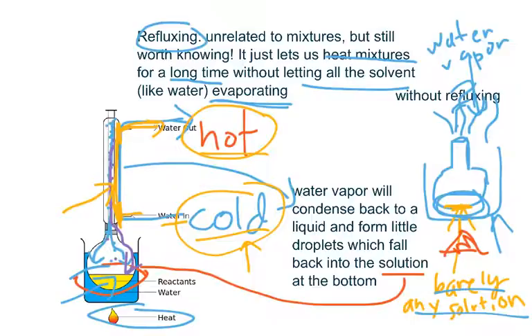And when you cool something down, you're basically absorbing the heat for it. So this gas will turn to liquid, these water vapor molecules will turn to liquid and lose heat, but in turn the water around it will absorb this heat for it and cool it down, and that's why it becomes hotter when it escapes.